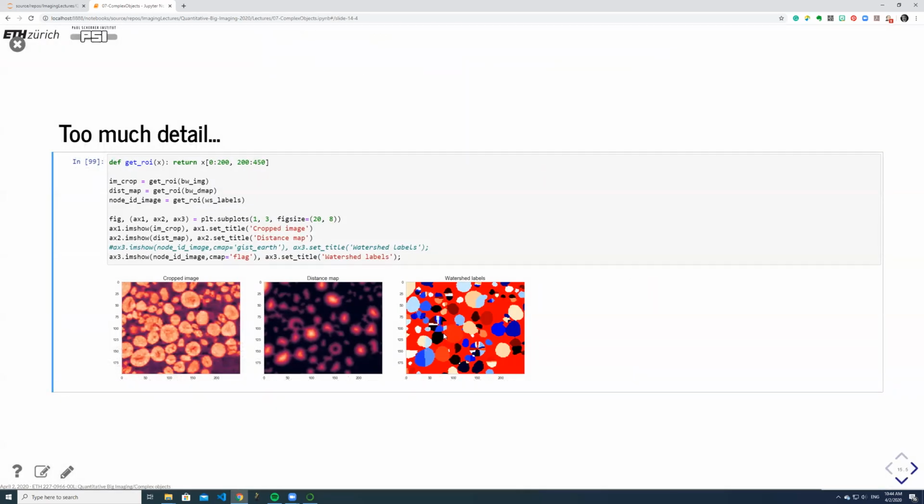And now you can see really nicely that this circle is segmented into, I don't know how many segments. Also the crest here is divided into pretty many. So essentially each item is over segmented, and that can be a little bit annoying.